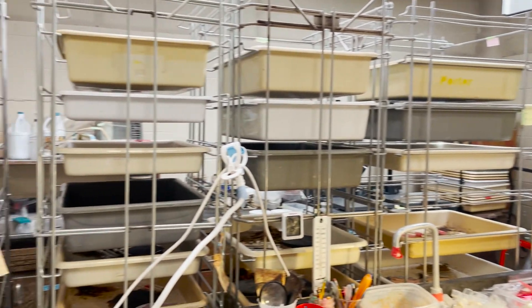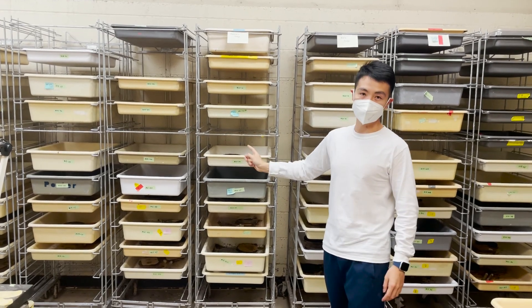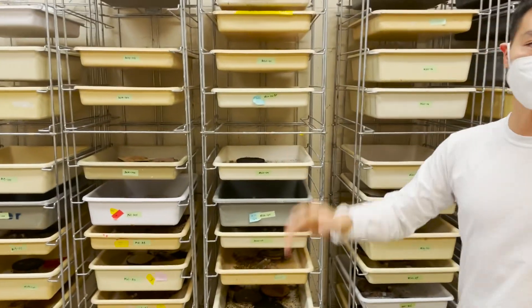This is our rearing facility. All of these trays host a bunch of fire ant colonies. One tray hosts one colony. You can see we have hundreds of colonies keeping them here.